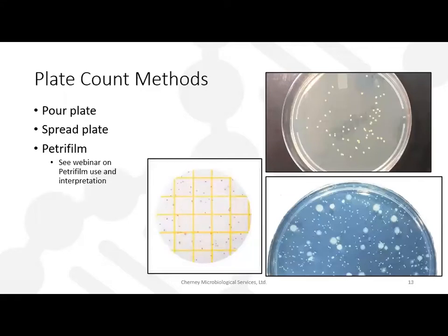Okay. And we've got a couple different plate count methods here. I'll briefly go over a pour plate, a spread plate. For the Petrifilm, last year we did a Petrifilm use and interpretation webinar. So if you want more specific information on Petrifilm, go back and view that on our website. But I'm going to go over pour and spread plate here a little bit further.